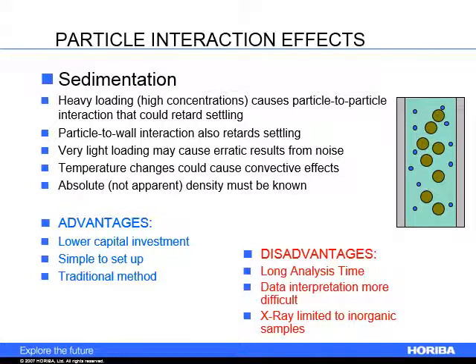This has been replaced largely by all these laser diffraction particle size systems, and on the very low end, some stuff like dynamic light scattering that I'm not going to talk a lot about. But sedimentation has been moved out by techniques that are just easier to do. But it still is an option that you may encounter from time to time.